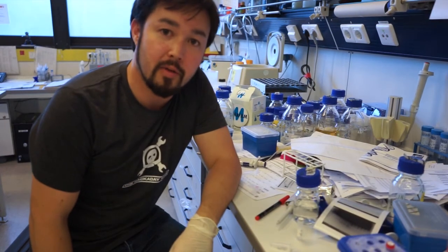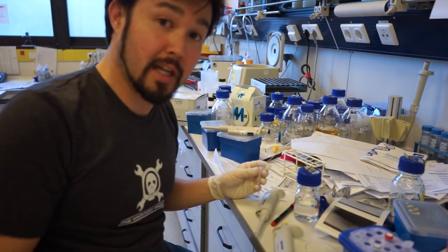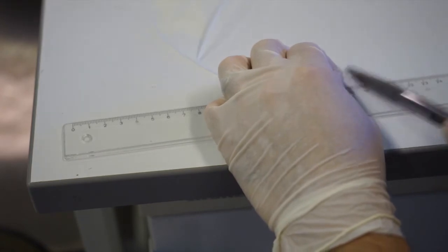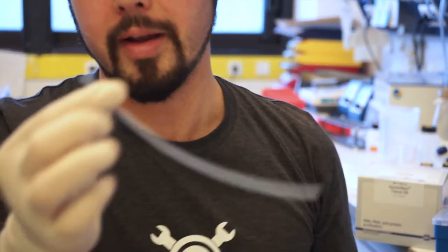We have to mix together our PCR reaction. Now it's time to mix it with our sample of DNA from the crime scene. We take some thin-walled Teflon tube and we cut a length that's about 18 centimeters long. We also take some silicon tubing that's about 1 centimeter long. You can quite easily fit the Teflon tubing into the silicon tubing.